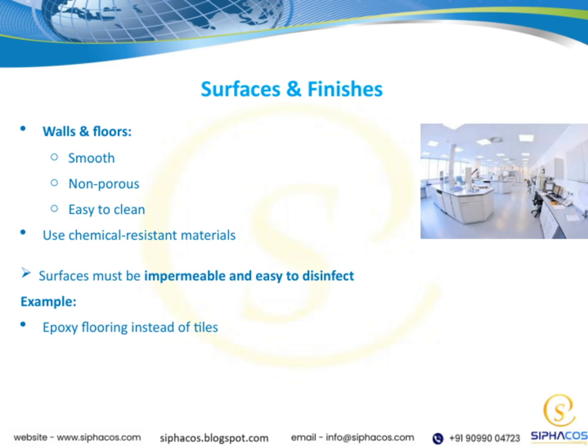For example, epoxy flooring is a great alternative to traditional tiles because it provides a seamless, durable, and easily disinfected surface. Overall, choosing the right surfaces and finishes directly supports our goal of creating safe, clean, and efficient spaces.